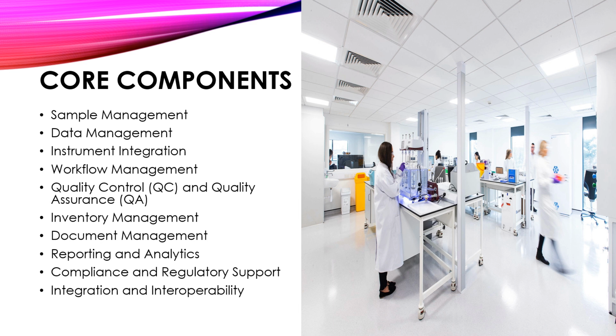A laboratory management system facilitates the tracking of samples throughout the laboratory workflow. It includes functionalities such as sample accessioning, labeling, tracking, storage location management, and sample status monitoring.